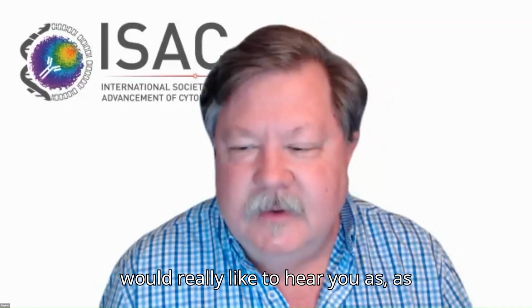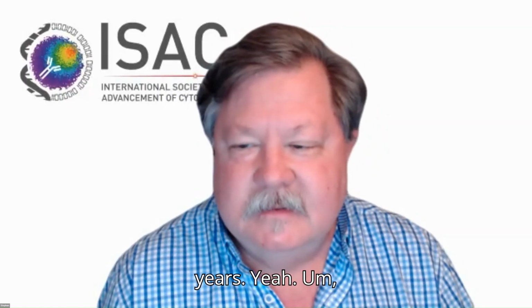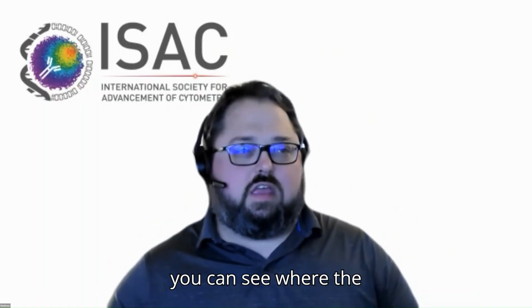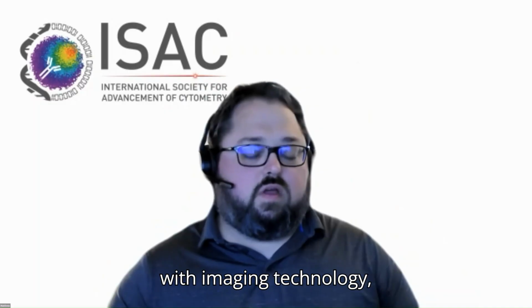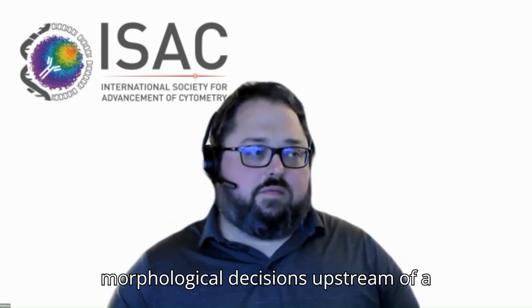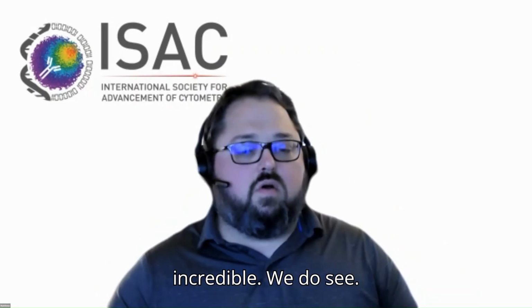Matt, scroll all the way down to the end. I would really like to hear you, as somebody in industry, discuss what's coming in the next 5 years. Yeah, I think when you look at the research, you can see where the needs are being created. Obviously, we see movement with imaging technology, the ability to make morphological decisions upstream of a sort becoming hallmarks and new avenues into the science. I think that's really, really important, really incredible.